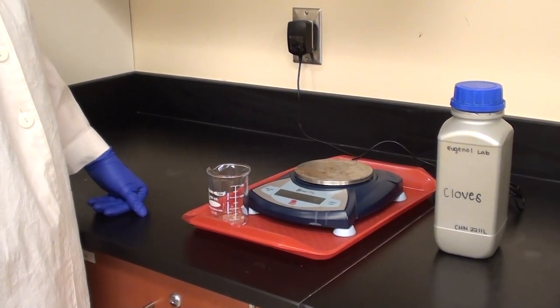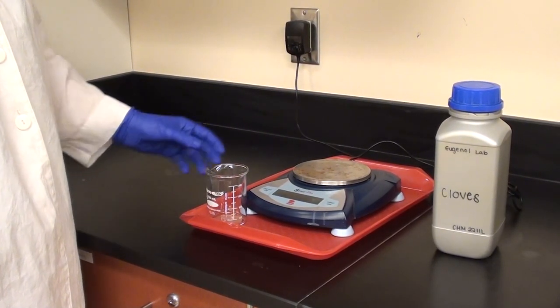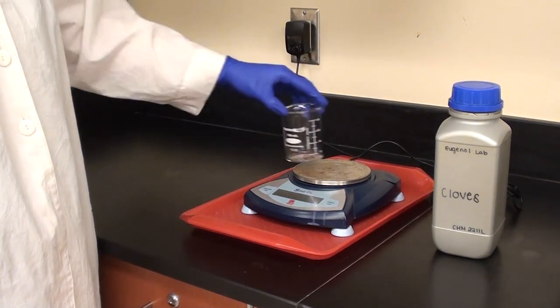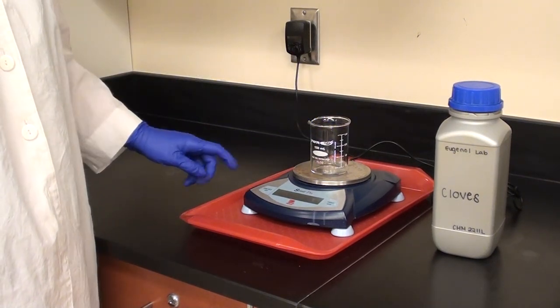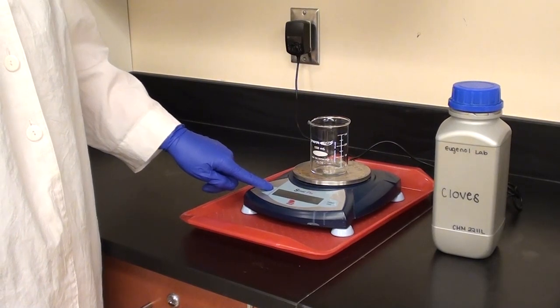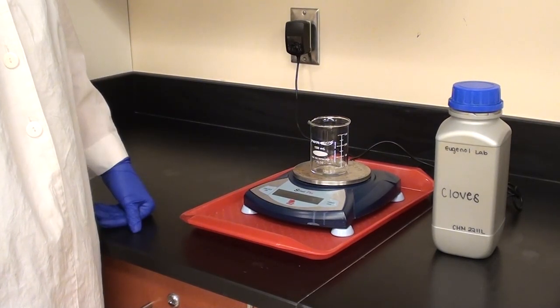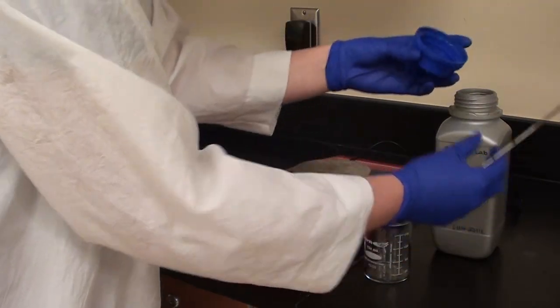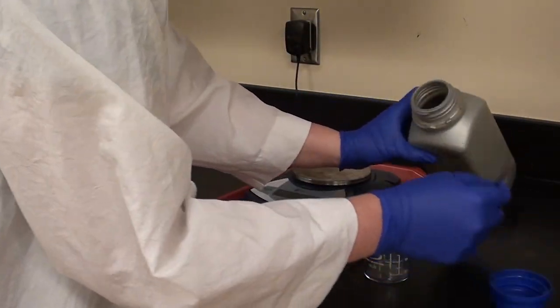We're going to weigh out the cloves here, and we're going to weigh them off the balance. She's zeroing out the beaker here, and she takes it off the balance, and now she adds the cloves. She's going to put a fairly small amount in to begin with.